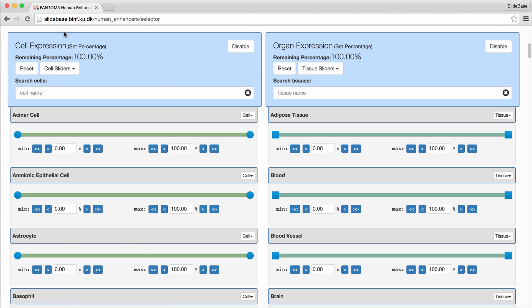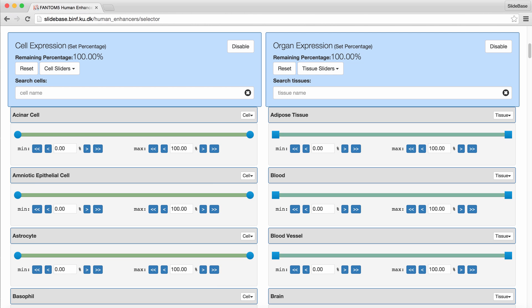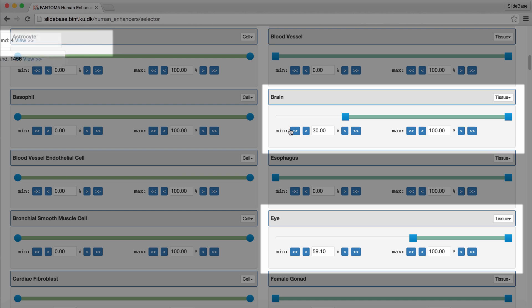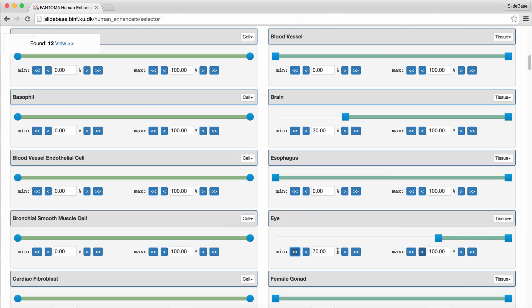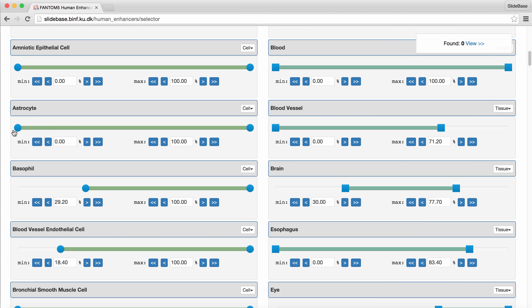We can observe that we have two panels of sliders. The left panel contains the primary cell samples and the right panel contains the organ or tissue samples. Both panels influence the resulting enhancers but their sliders are independent. In both panels we can set the sliders to at most 100%. For example, in the organ panel, if we set the constraints to at least approximately 30% for brain, we cannot have more than 70% for eye. Notice how when we change the brain and eye slider values, the resulting number of enhancers immediately changes. We can still add negative sample selection on any of our tissues, and we are free to set other constraints for primary cells even if we have reached 100% for tissue.